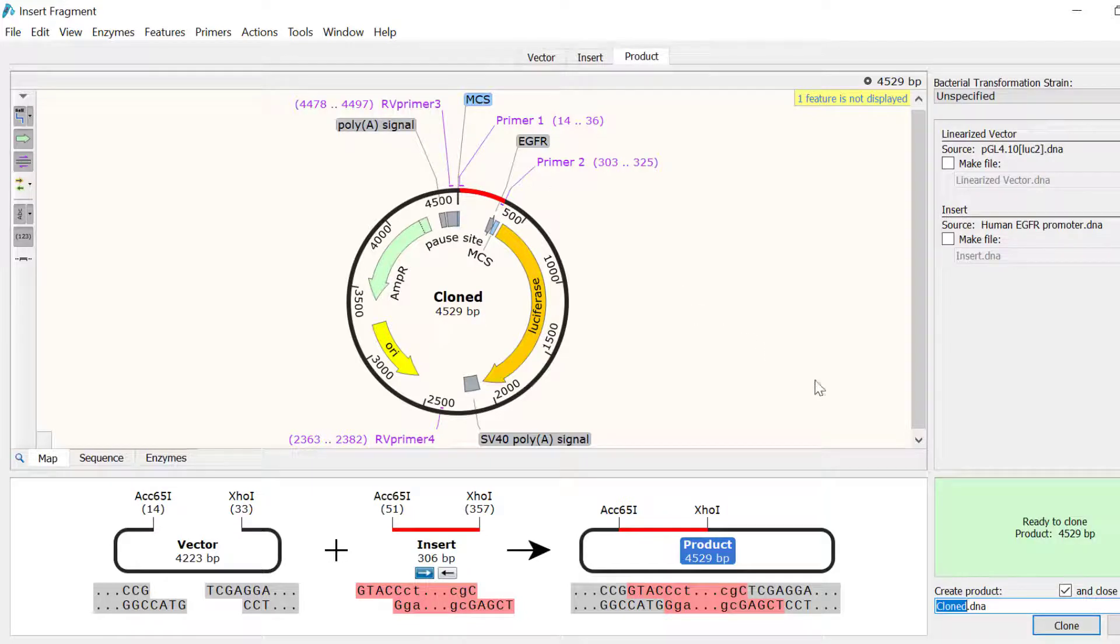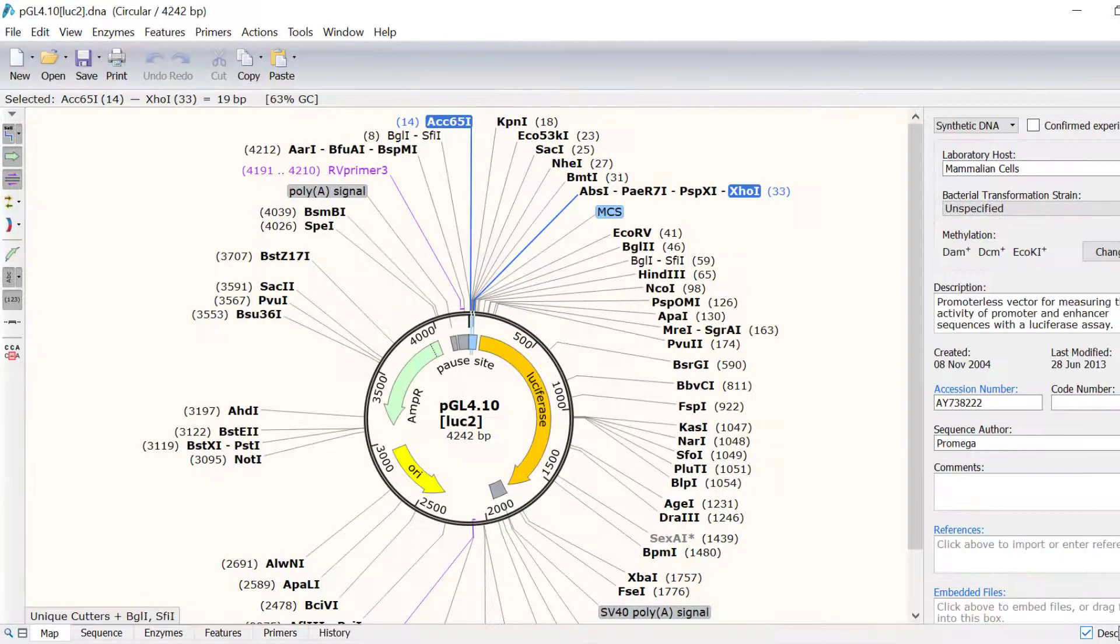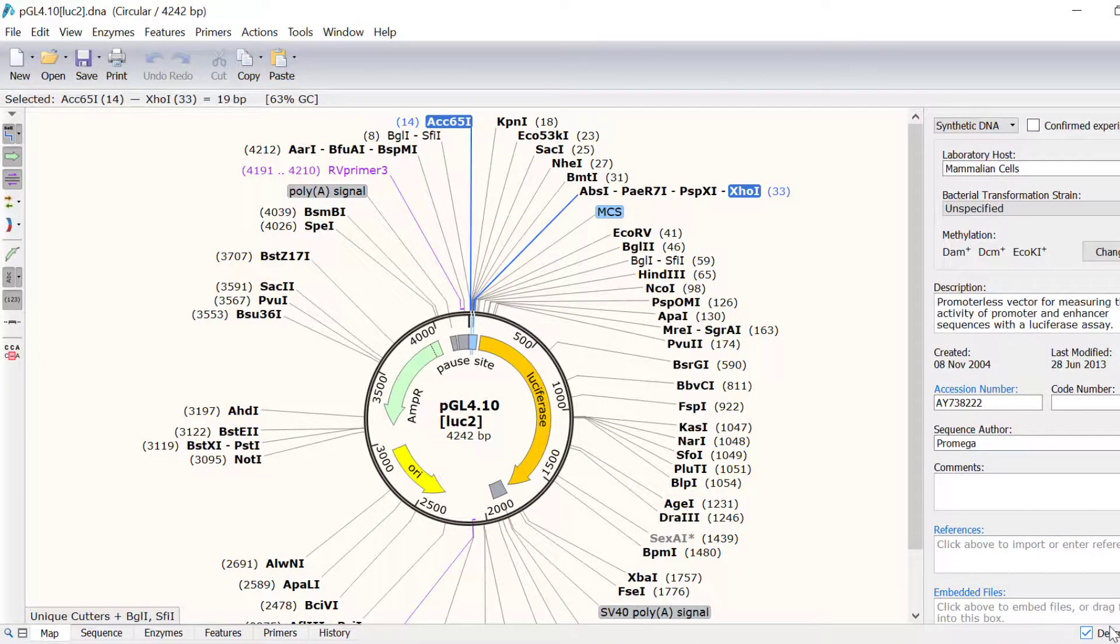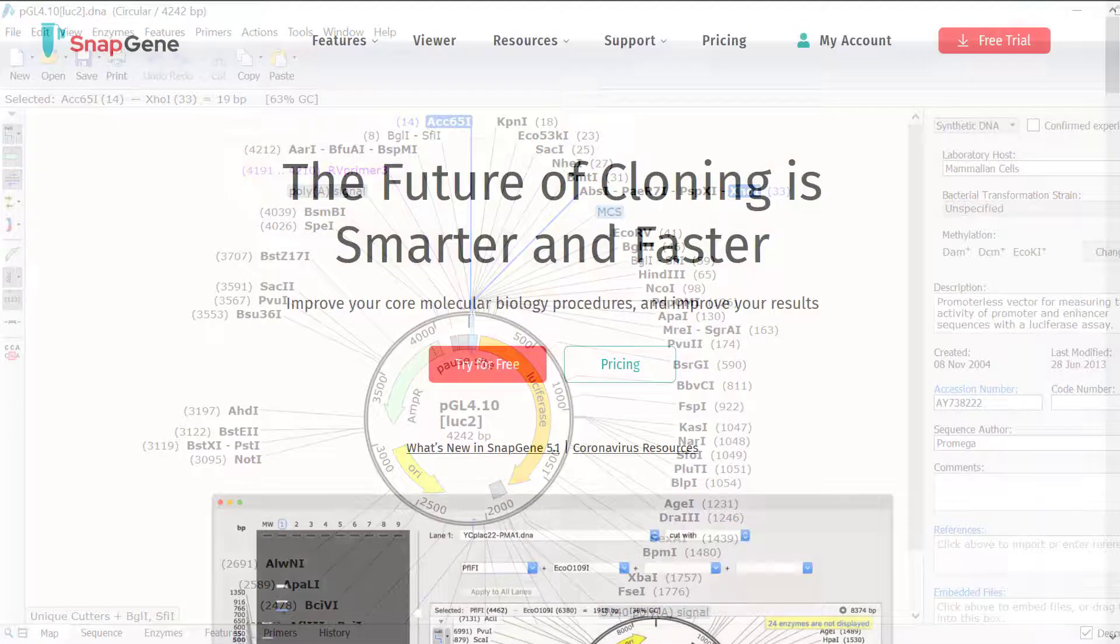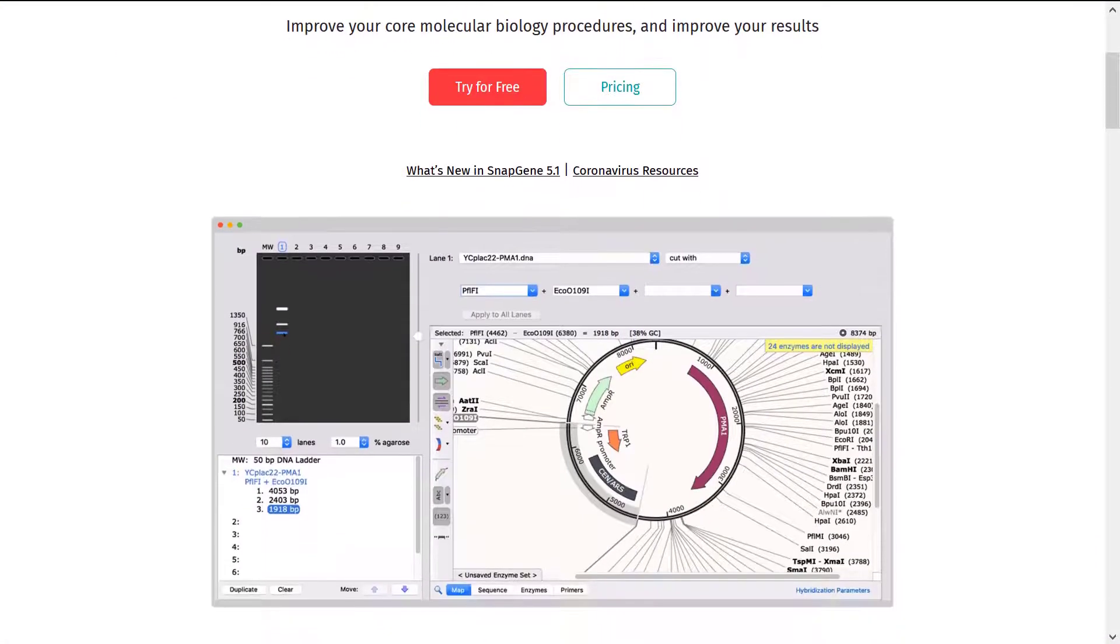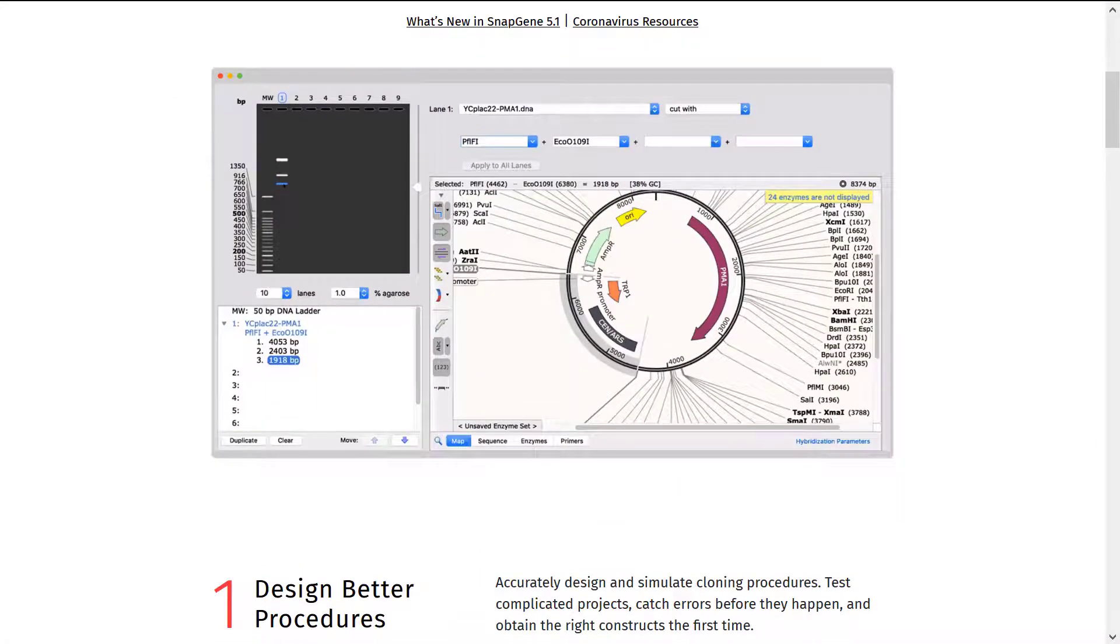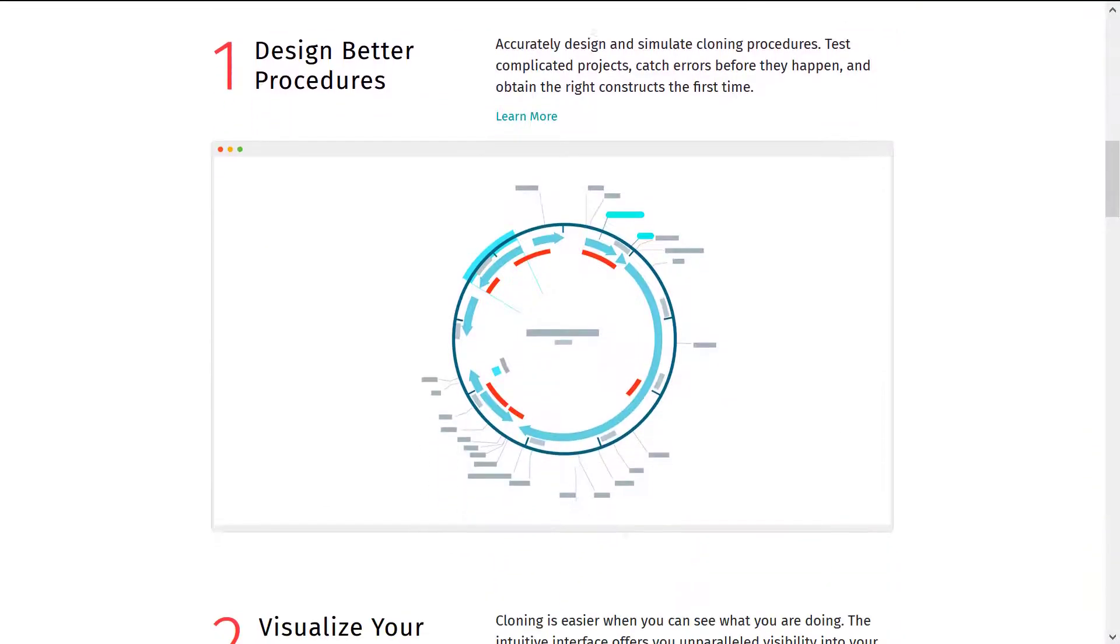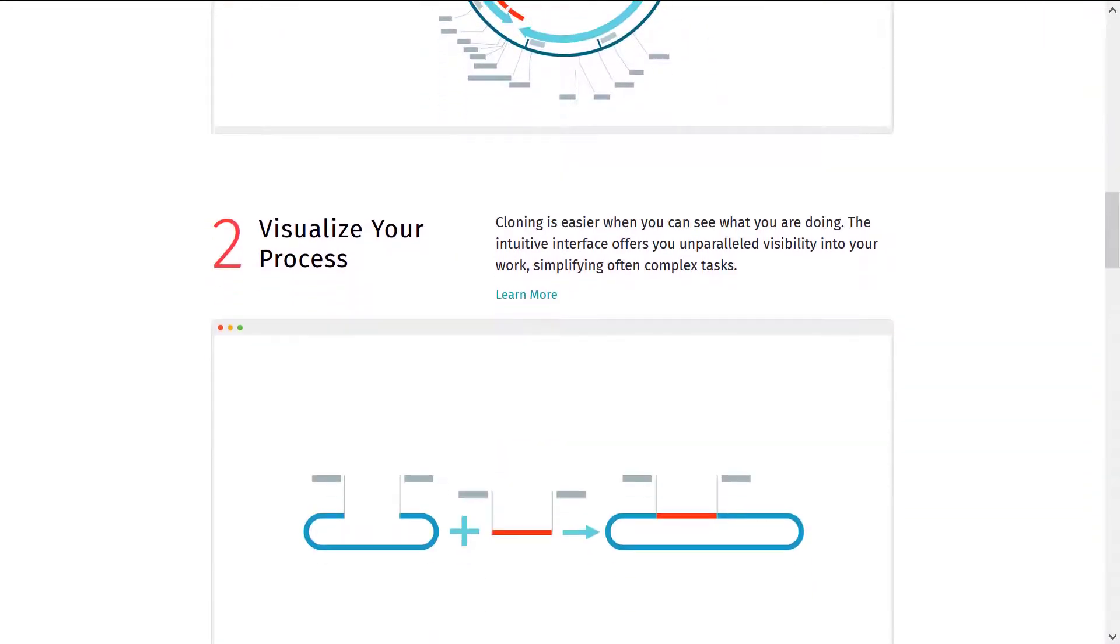And that wraps up this video tutorial. In this video, you have learnt two ways to simulate restriction and insertion cloning in SnapGene. For more information about simulating other cloning techniques in SnapGene, check out the other tutorials on the SnapGene website.